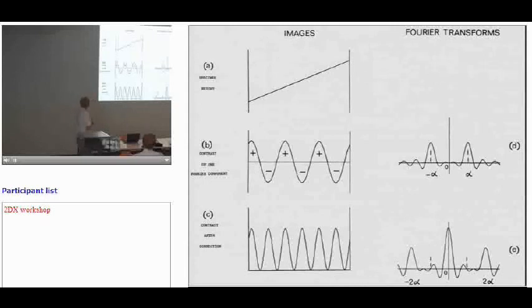And if you look at one spot, delta f theta squared increases, and the sine of it goes like this. So as you go across the image, the contrast for a particular Fourier component goes linearly from positive to negative, and so on, across the image. And if you simply average it, there'll be nothing at that Fourier component's exact position, because you'll have an equal number of positive and negative spots.